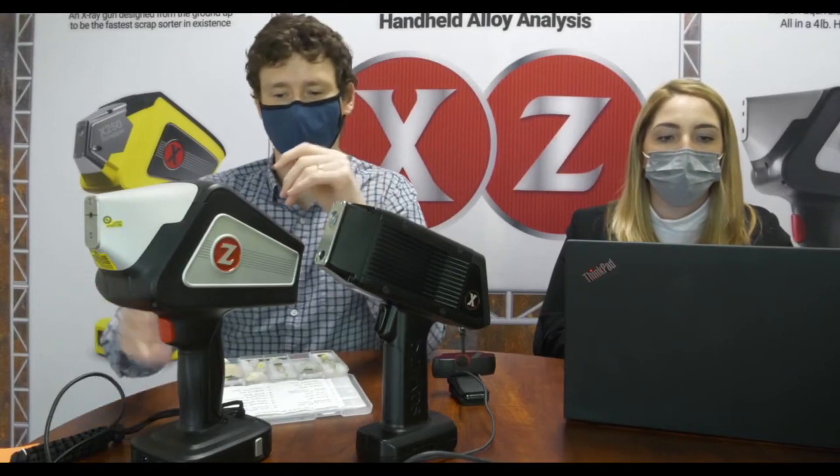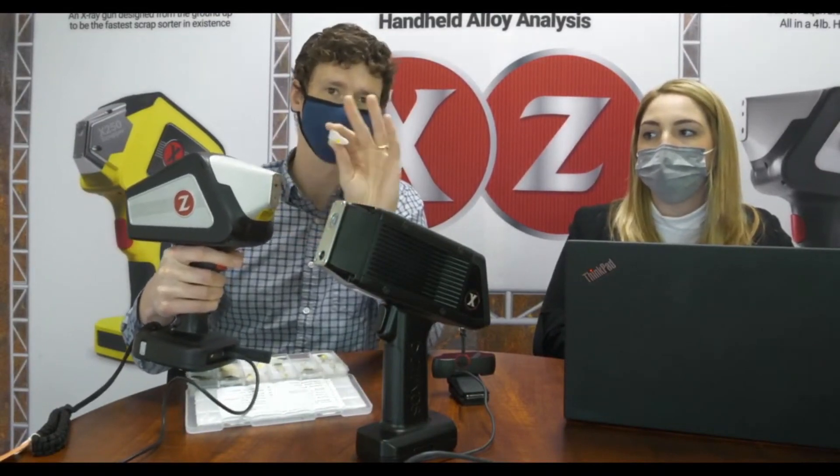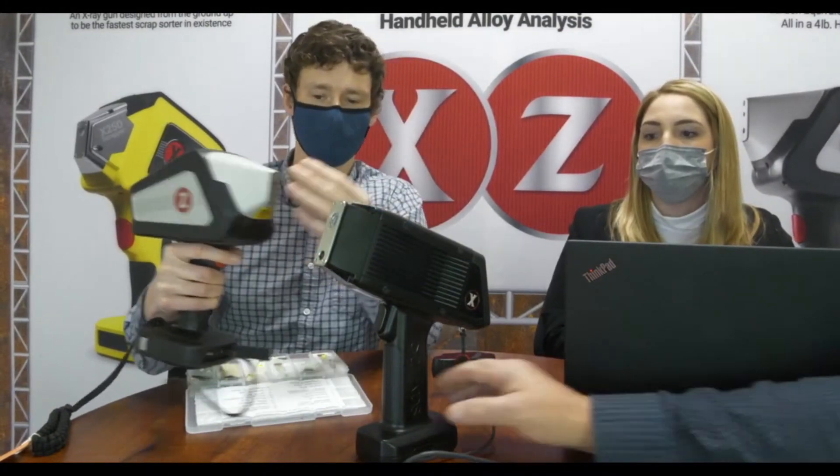Because this is a laser-based technique, you don't have to worry at all about X-ray radiation. You can do cool things like test a sample right in your hand and not worry about X-rays going through the sample and interacting with your hand, because there are no X-rays. You never want to do that with an XRF — hold a sample like this and pull the trigger.